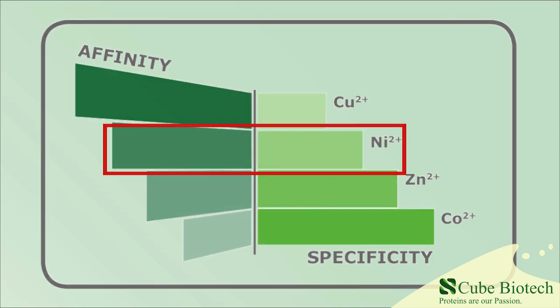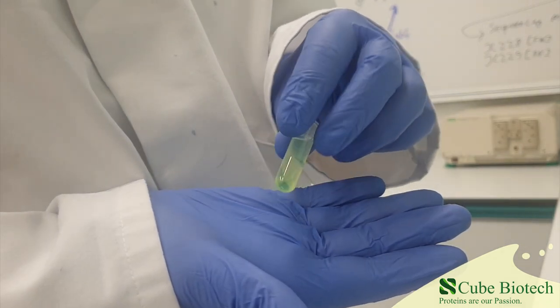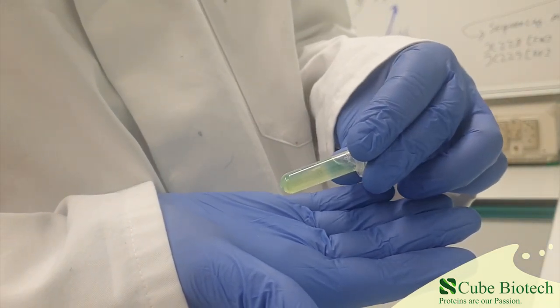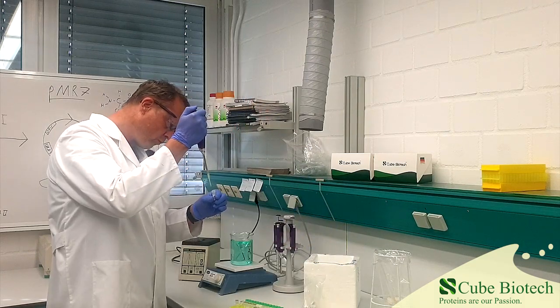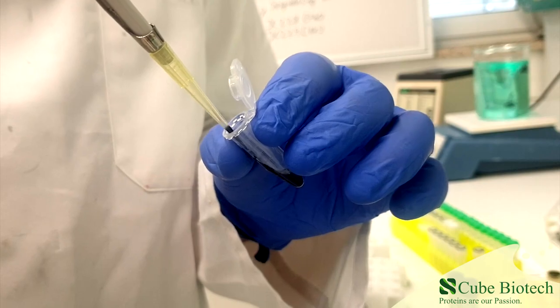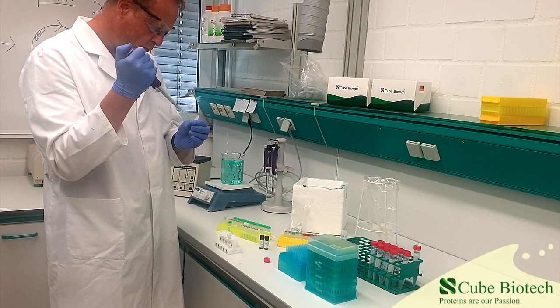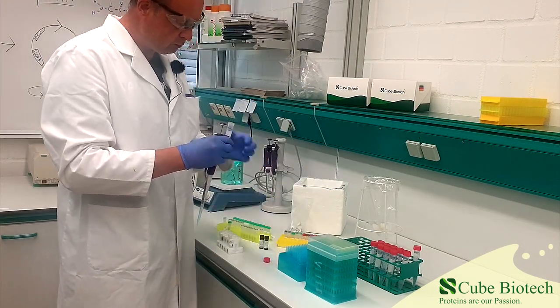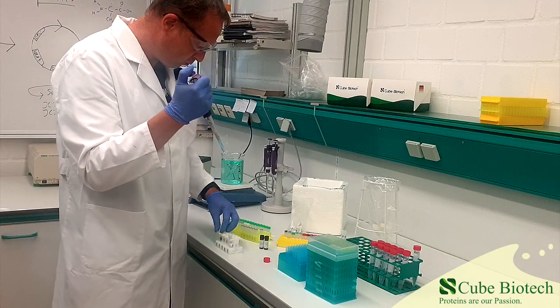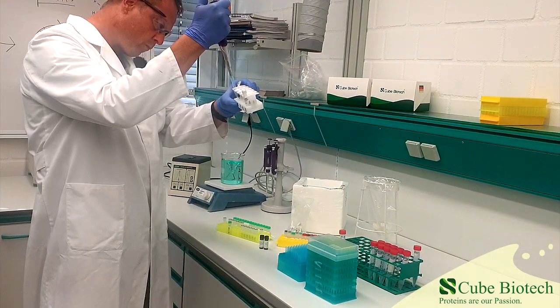We are starting with this protein lysate, in which you can clearly see the massive amounts of GFP. We add our pure Cube Nickel NTA MAC beads into an empty Eppendorf tube. The first step is to remove the storage buffer in which the MAC beads are kept. Then we add incubation buffer to prepare the beads for the upcoming contact with the protein. Make sure to mix well.